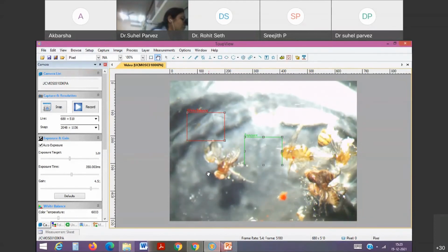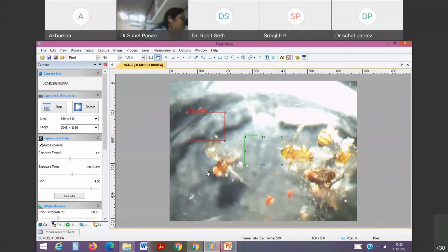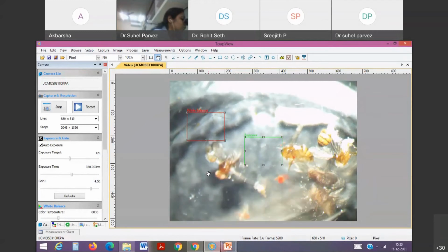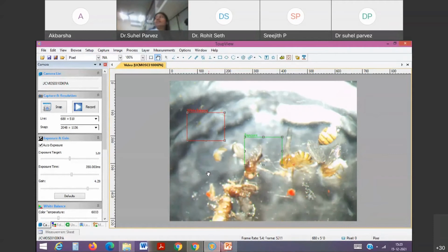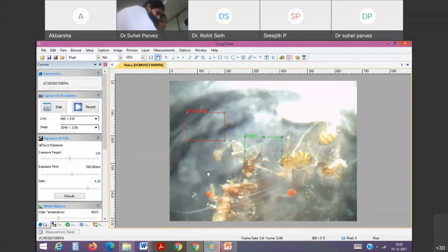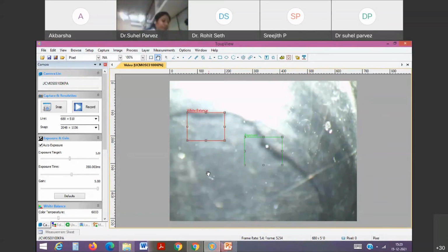This is how we remove it. We'll get the brain. Try. You can try once again. Is the buffer down?